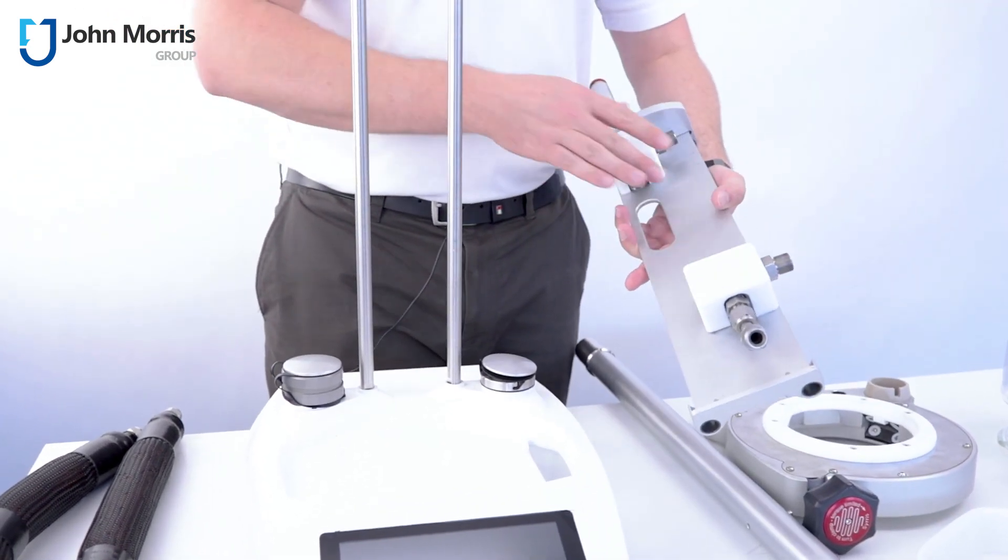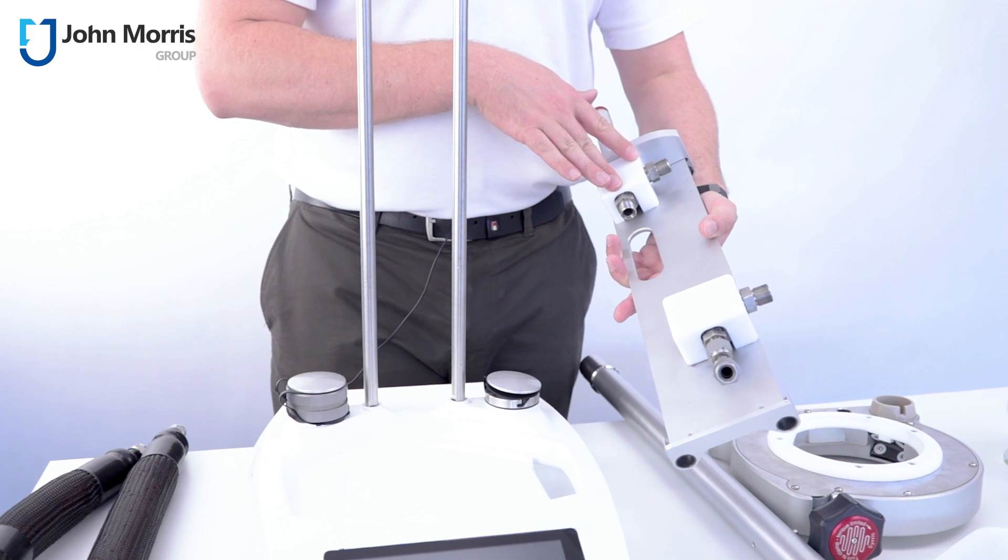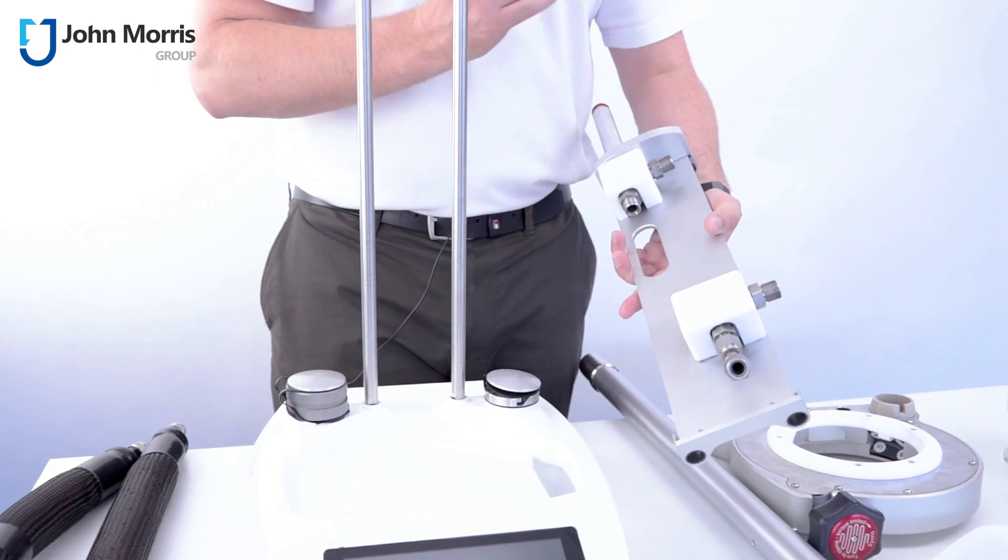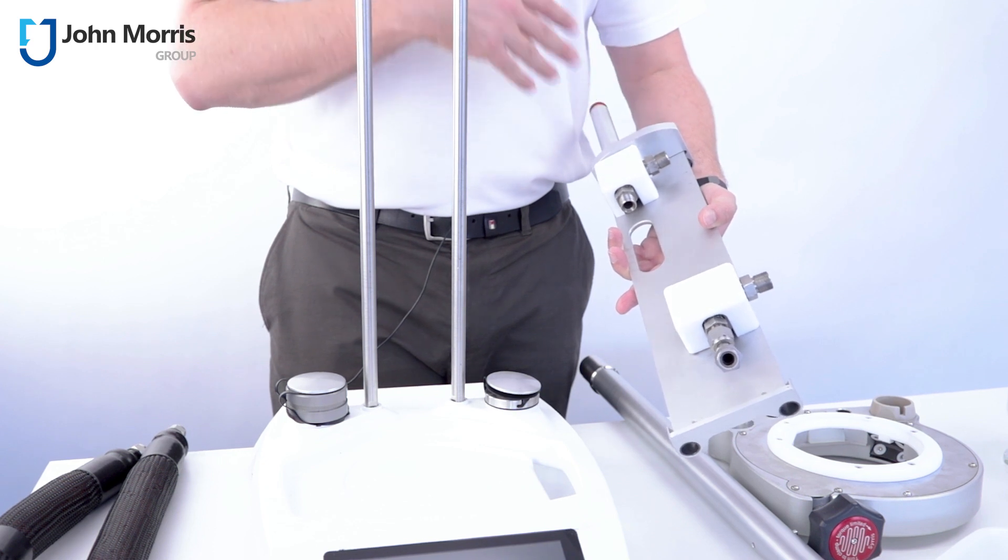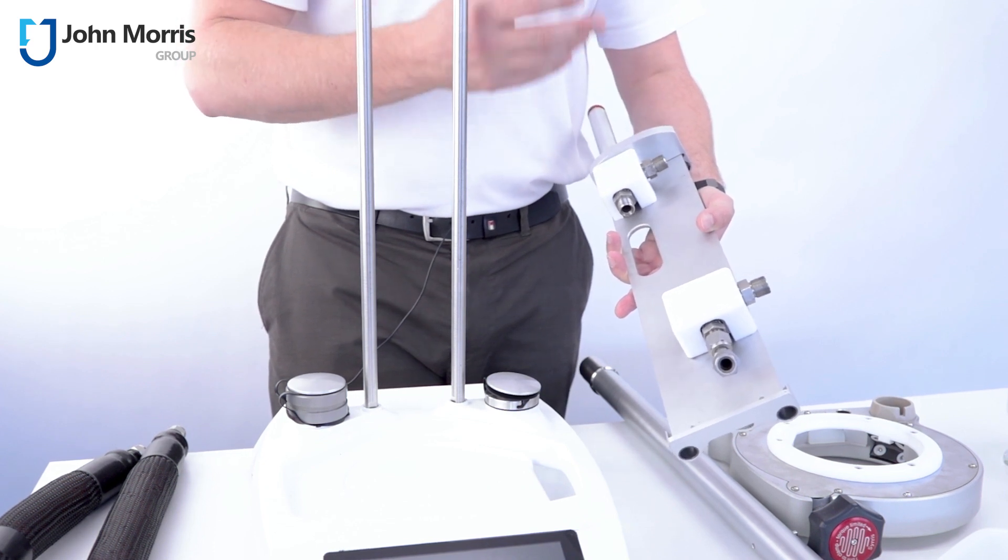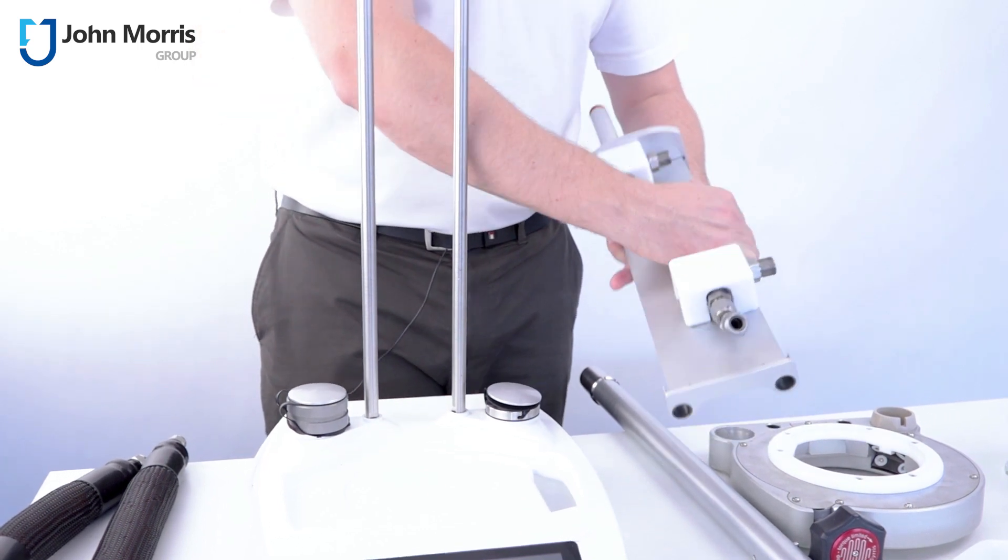So what we have here is some connection ports for you to have external heating and cooling fluid flowing through your jacket and reactor, and what that enables you to do is to leave your external heater chiller connected but disconnected from your water jacket if you'd like or your fluid jacket. Let's put it together.